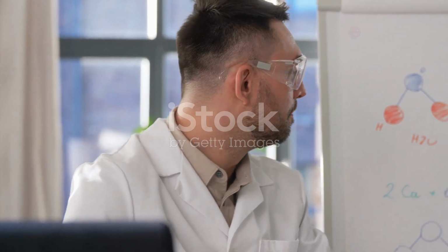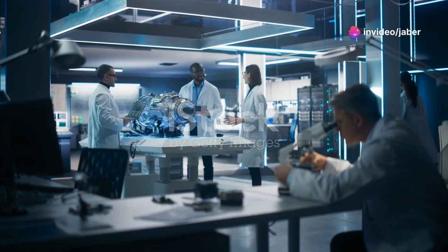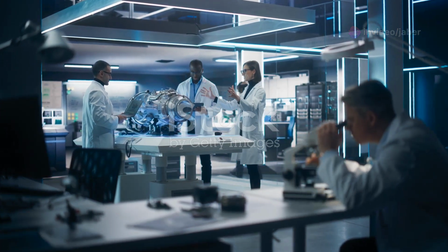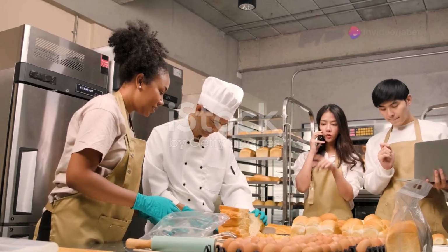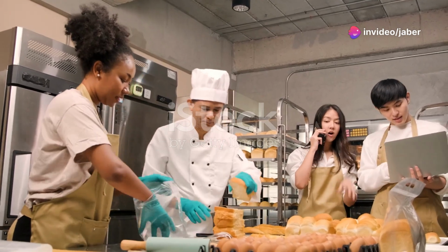In addition to these standard normalization methods, there's another technique called batch normalization that deserves attention. It's particularly useful when dealing with large-scale RNA Seq studies involving multiple batches of samples processed at different times or in different laboratories. Imagine trying to compare the results of a baking competition where different ovens were used, each with its own quirks and temperature variations.